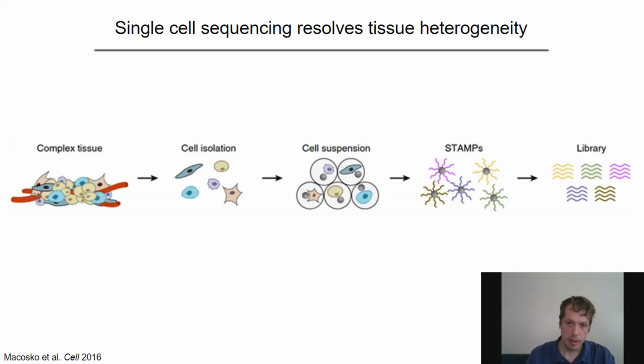We add them together with a so-called barcoding bead. The barcoding bead brings in a primer with a unique droplet-specific barcode, and this allows you then to create a cDNA library using this barcoded primer. If you sequence the collection of all these cDNAs, you can then use this barcode to reassociate the RNA profile with a particular droplet, or with a cell of origin, basically.